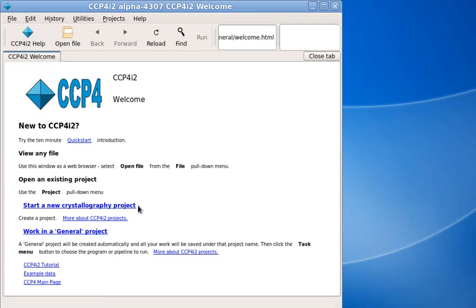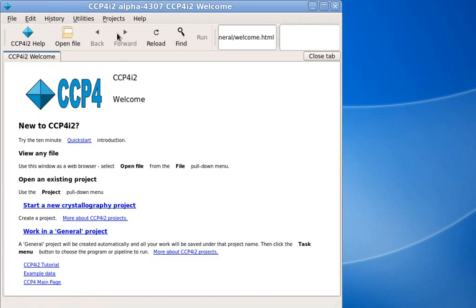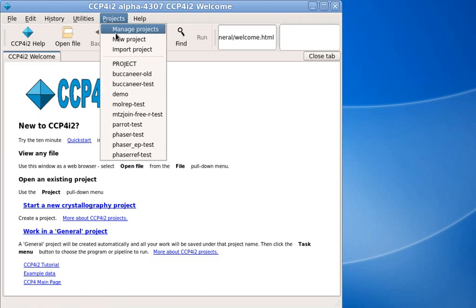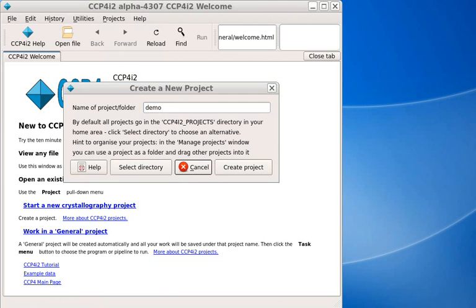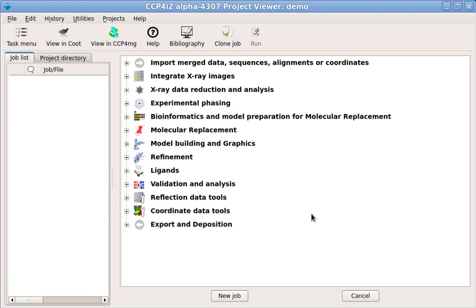To start a new project, you can use this link, or go to the projects menu and select new project. Give your project a name and click create project. A project window will then appear.